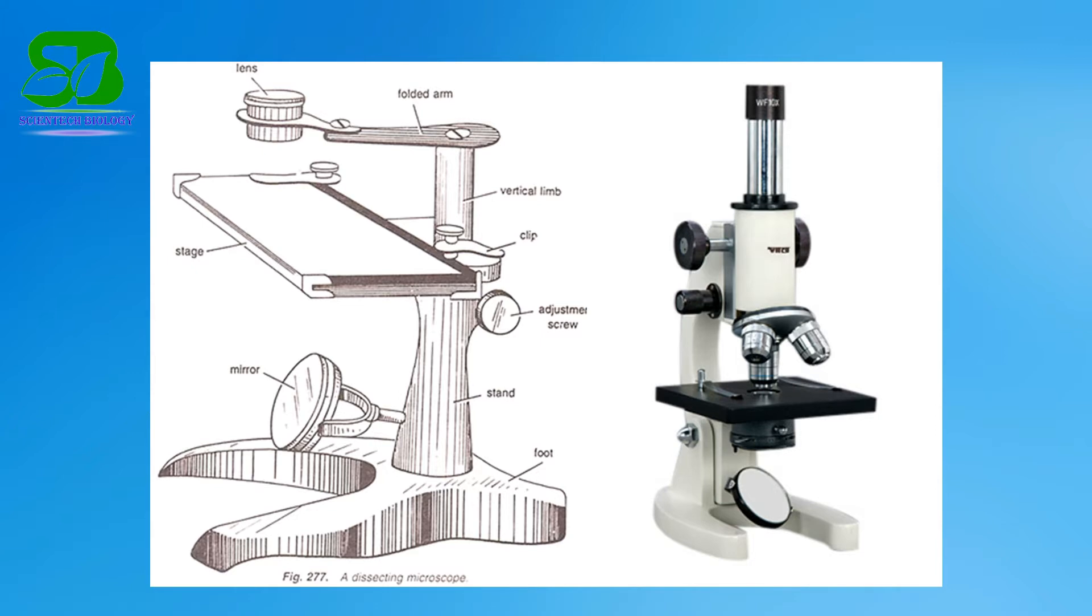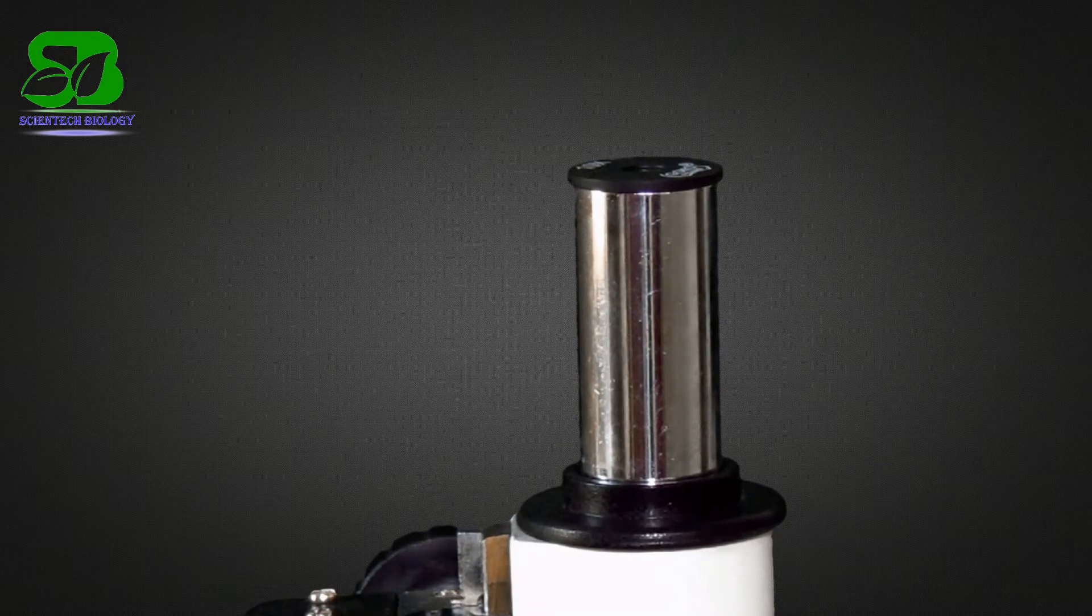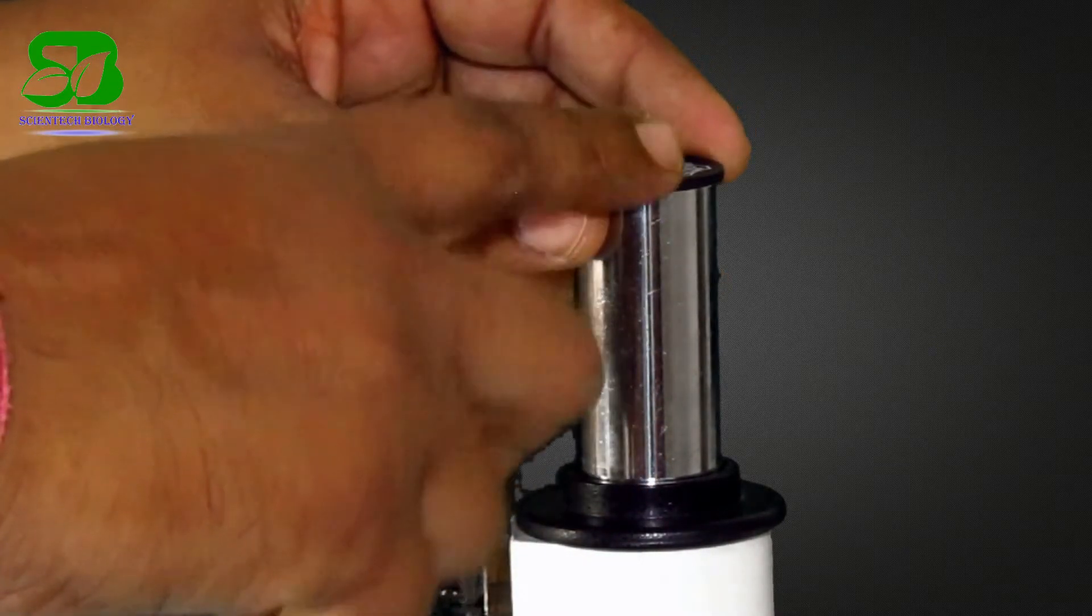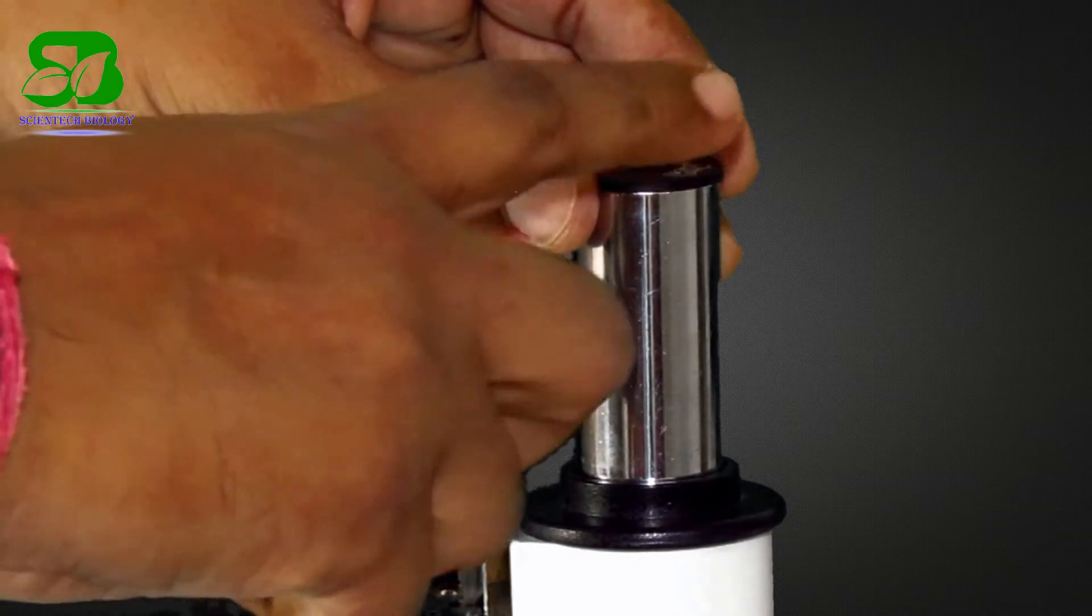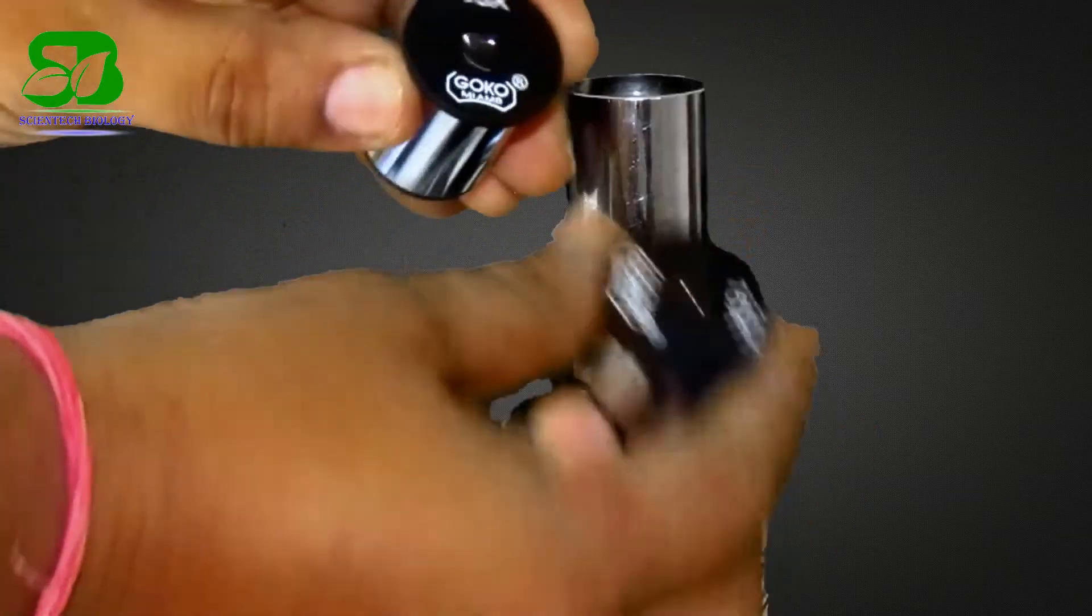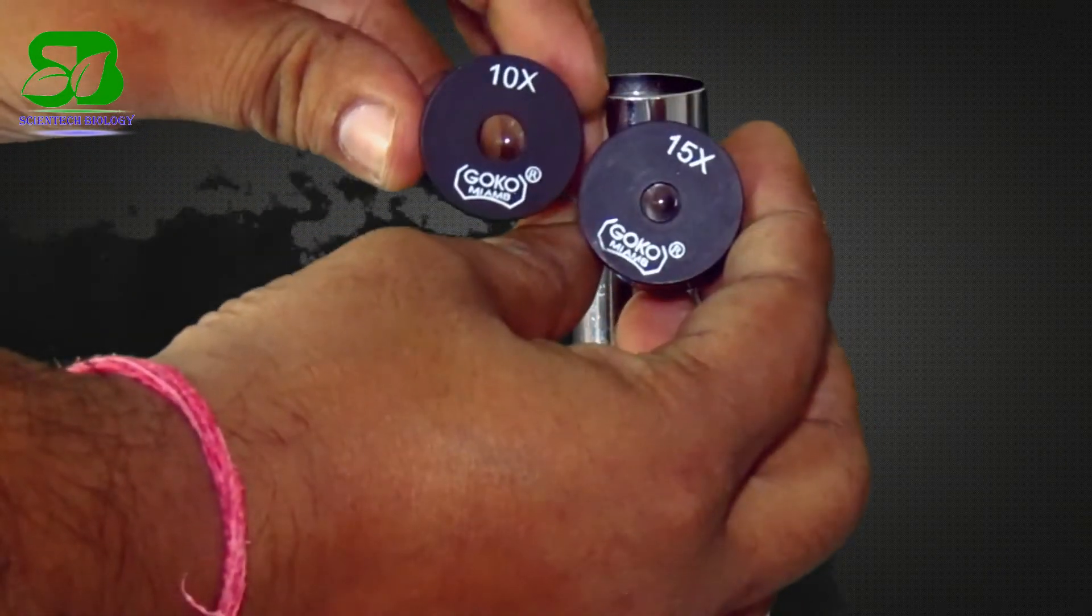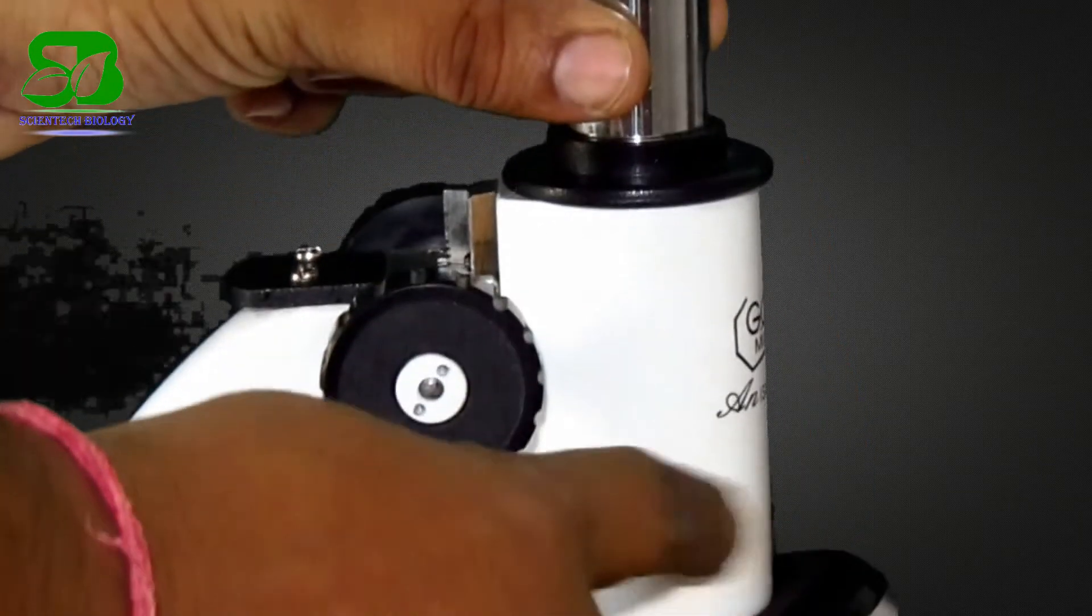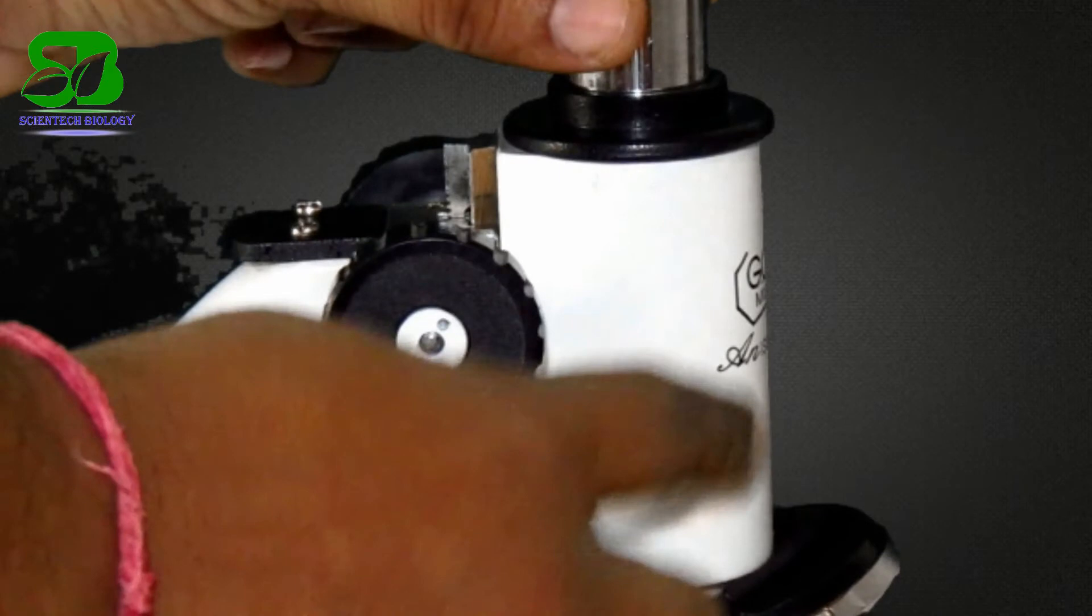One is eyepiece and the other is objective lens. So let's see the parts of the compound microscope. This is the eyepiece lens placed at the top and it is usually 10x or 15x power. Here you can see the tube that connects the eyepiece to the objective lens.